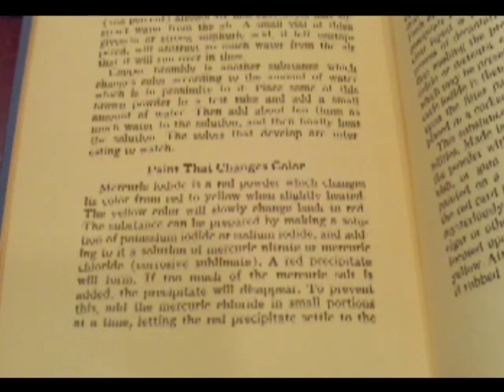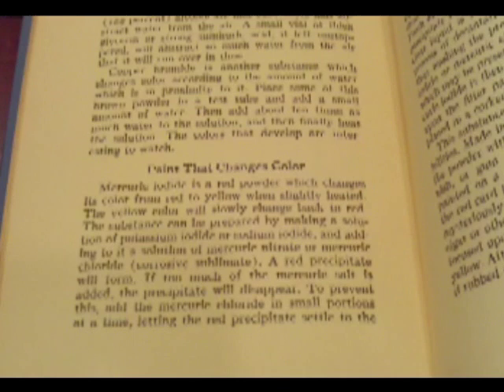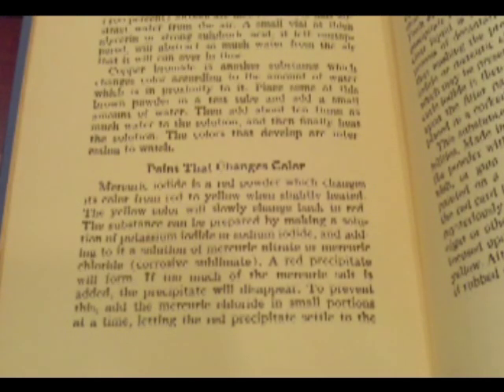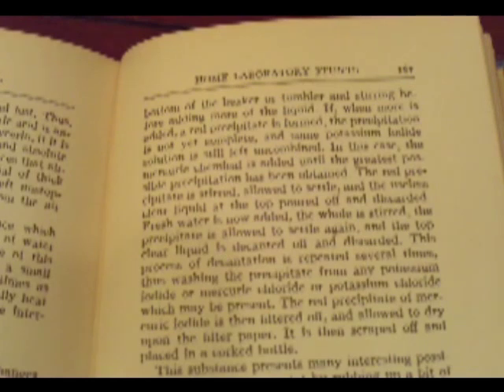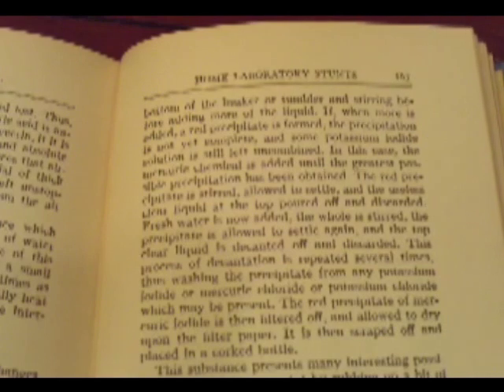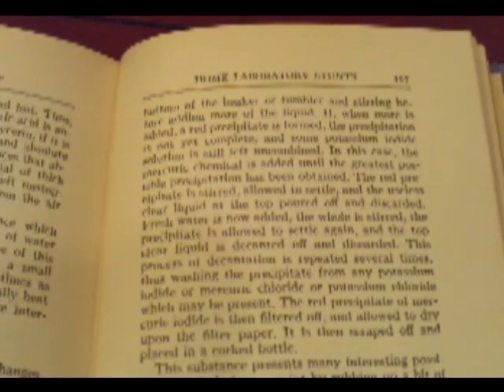In it, there is a section on how to use mercury iodide to make a paint, and gives one idea of how to use the paint on cards, and how to use a magnifying glass to heat it up. To change it back quickly, you would just use your finger and rub it off, or rub a small layer off.